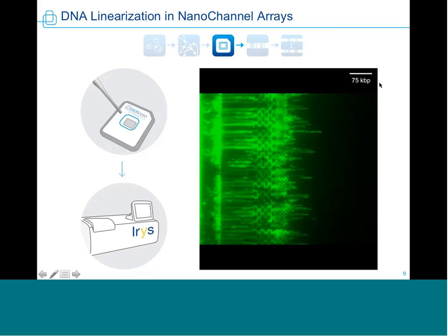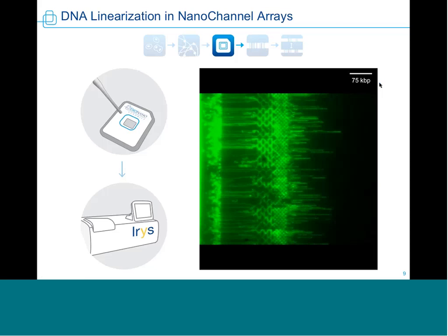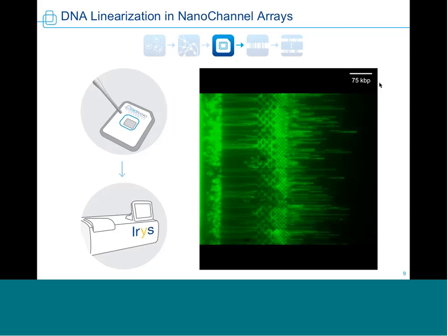Ali's focus really is on computational and experimental methods and developing these for assembling genomes. And so he'll take over from there and describe the pipeline that they've developed and how they've integrated BioNano data with next-gen sequencing data, in particular Pacific Bio's data, for building extremely high-quality assemblies and doing structural variation discovery.